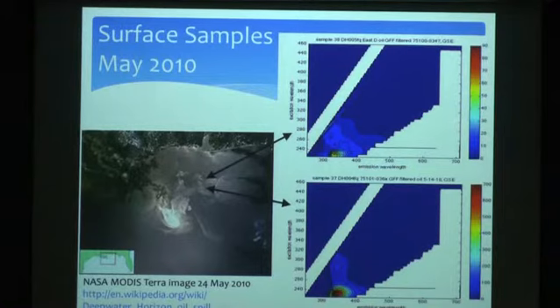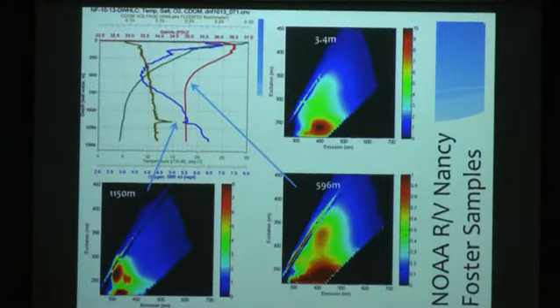The technique is so sensitive that the dominant signal in these samples is scattering from water, the Rayleigh and the Raman scattering, and that messes things up and makes it really hard to look at. So we just kind of cut that out and look at what's underneath. So definitely oil there. There was a lot of interest in the subsurface oil plume.